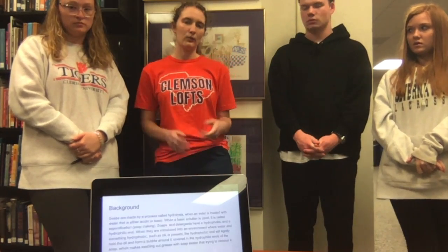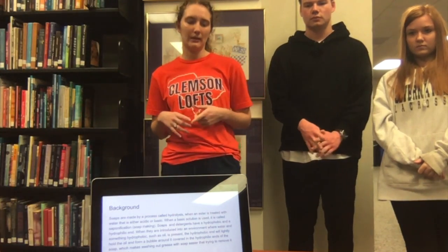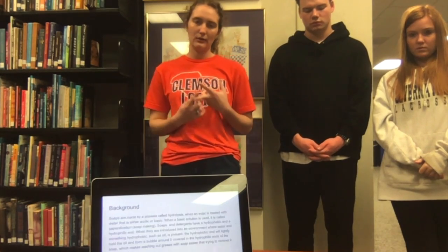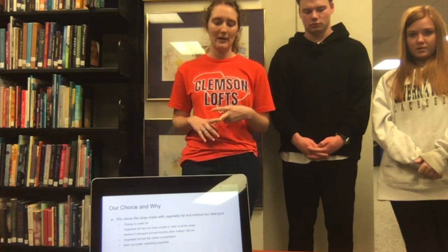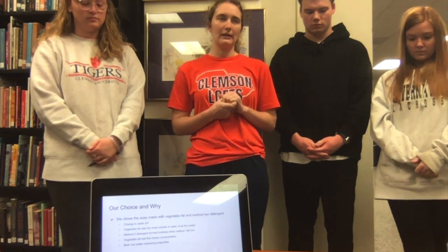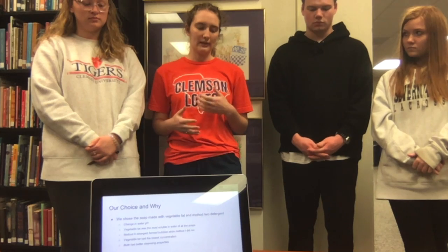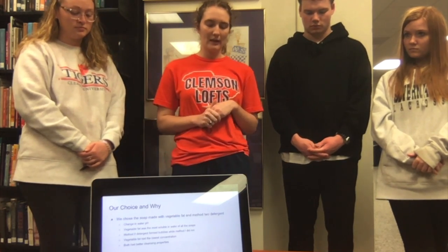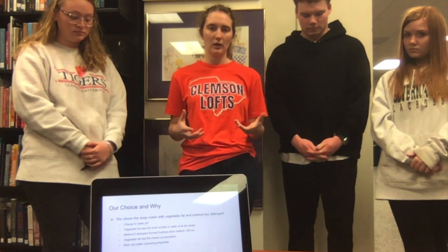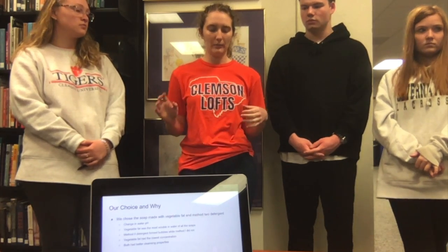Our choice of which was the best soap and which was the best detergent was that vegetable fat was the best choice for the alternative soap production method, and that method 2 for making detergent synthesis was the best. And we came to this conclusion because they each exhibited the least amount of change in pH of the water samples that were tested. And for vegetable fat, it was the most soluble of all the soaps. It was at least partially soluble, so that meant that it would not stay in the water and pollute it.